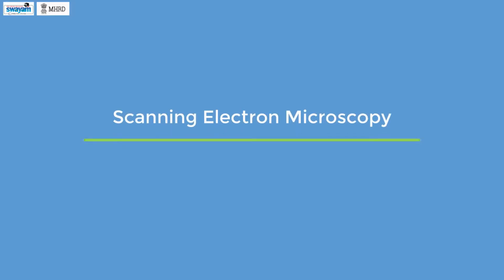Scanning electron microscopy. In short form, this is known as SEM. As the name suggests, SEM is one type of electron microscopy technique and addresses the resolution problem associated with light or optical microscopy techniques.